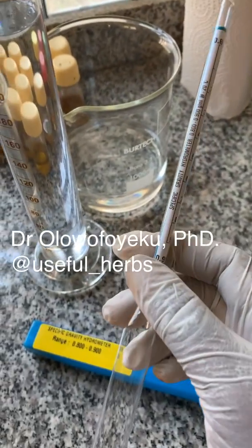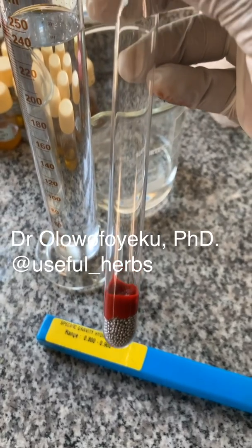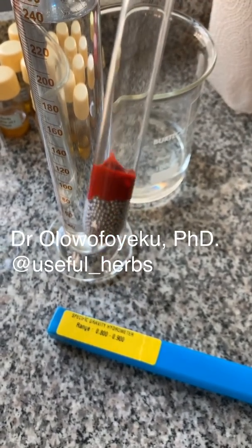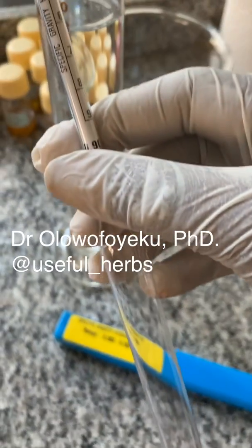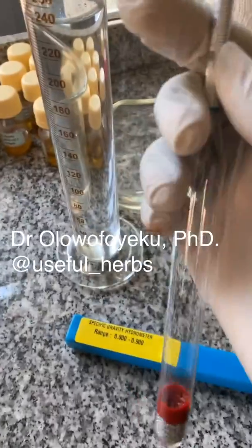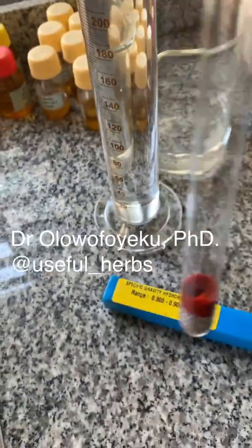This is called a hydrometer. It is used to measure the specific gravity of a substance. I had previously talked about how I was going to do a tutorial on how to use a hydrometer to determine the amount of ethanol in a liquid.